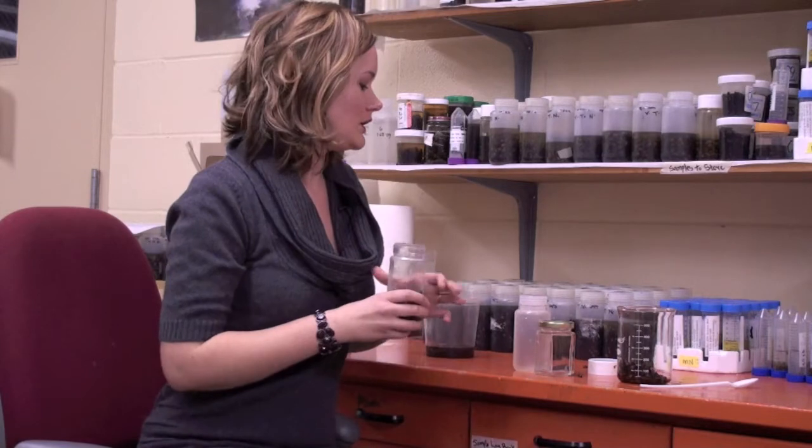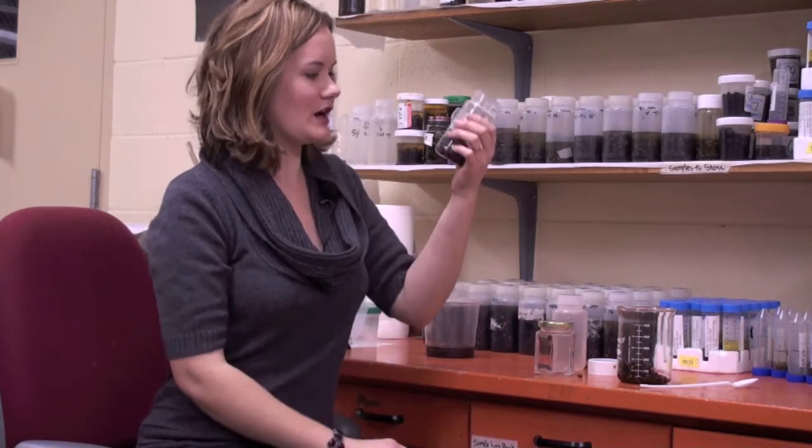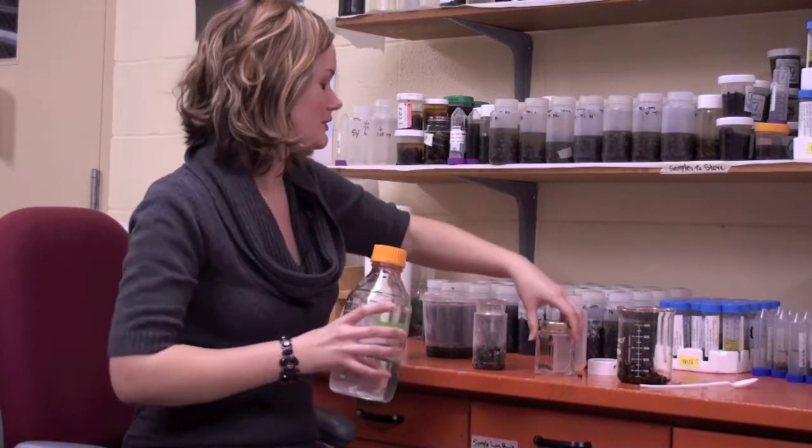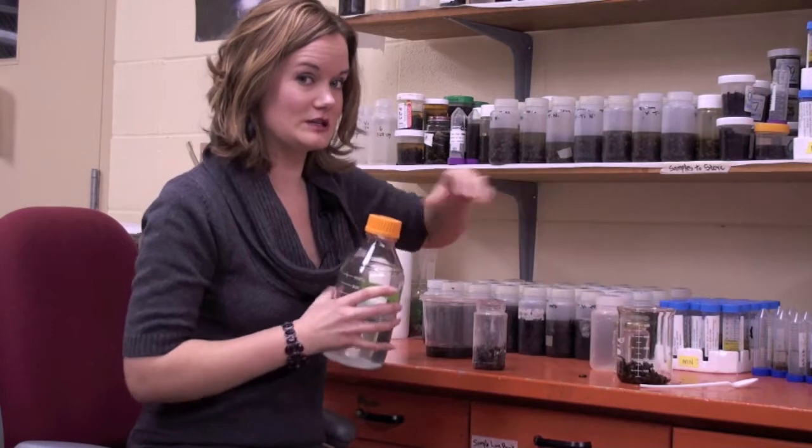Now if your colony is not doing well, I understand if you can't give me that many bees, but it's better for my analysis and more accurate data-wise if I can get half a cup to a cup of bees, if you can do it. So here's your bees. This is about half a cup to a cup. And what we're going to do is put alcohol inside the cup, and you're going to submerge the bees with the alcohol.